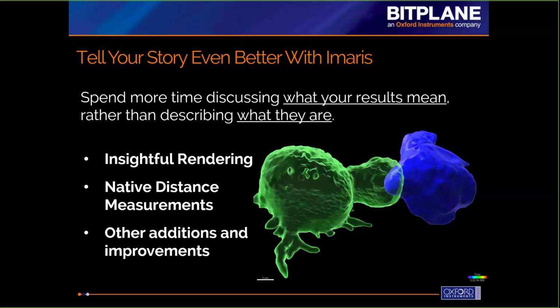And then finally, at the end of my presentation, I will talk about some other additions and other improvements that we've included in this release, and those, although smaller than these, are still incredibly important, and I know will put some smiles on a few customers' faces at least.